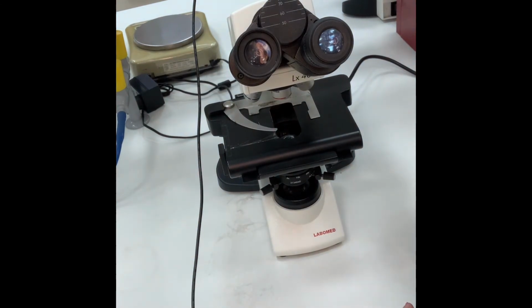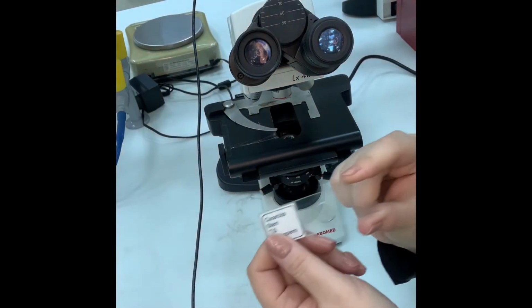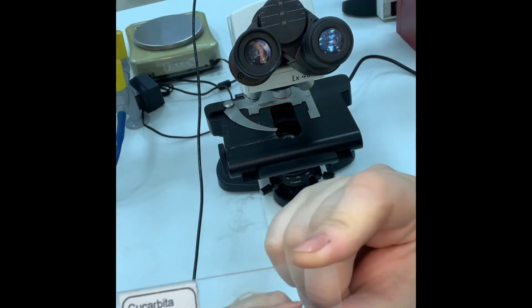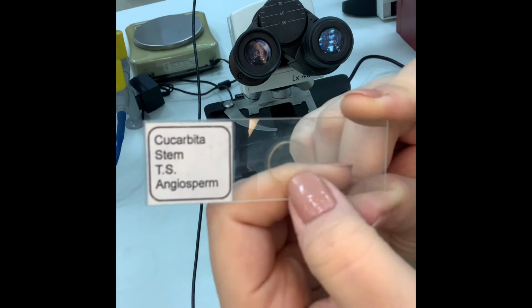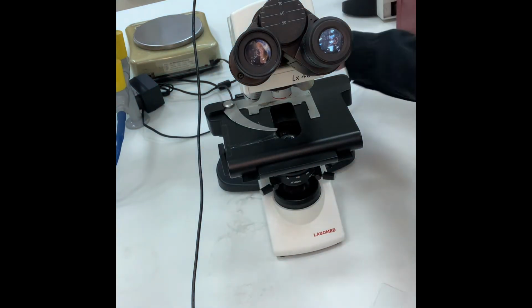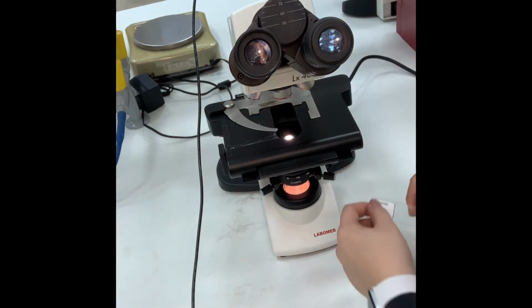Now, for the procedure, how to use the microscope, it is very simple. This is the microscopic slide. This is fixed, this is permanent, and this is where we have the sample itself under the cover slip. All that I have to do is sit and face the microscope.